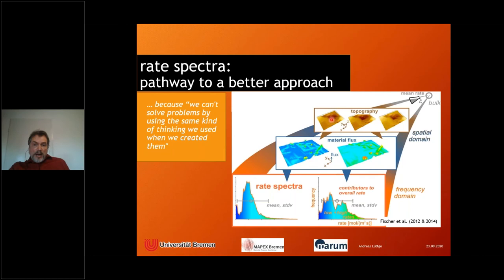Every two of these measurements give you a material flux map. Okay, that is the difference between these two surfaces. Right? And you can see this is pretty much the amount of material that corrodes away into the solution. Or if you do a crystal growth or a material deposition process, that gets deposited onto the surface.